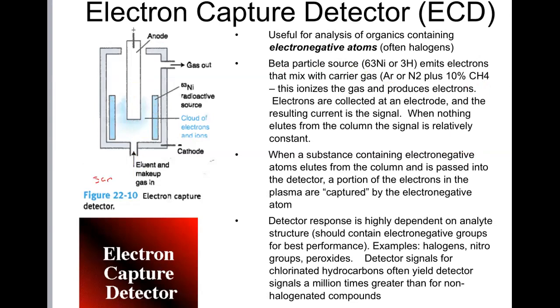But if our sample is introduced into that chamber, the sample molecules will also get up into this region where this collection of electrons and gas phase ions exist. And the sample itself may undergo degradative processes. It may degrade. But let's just say, for example, I had a molecule CH3F, and I'm just making this up as we go, okay? CH3F, we put that up here in this region. And let's just say it fully degrades into carbon atoms, some hydrogen atoms, and some fluorine. Now, fluorine is highly electronegative, right? And that's why I use this example, of course.